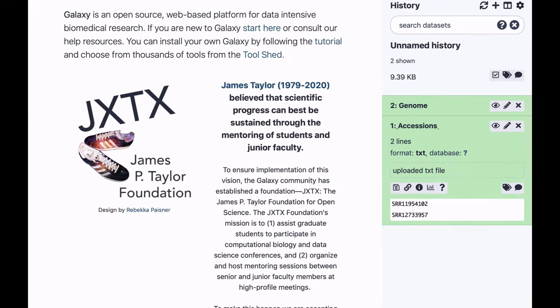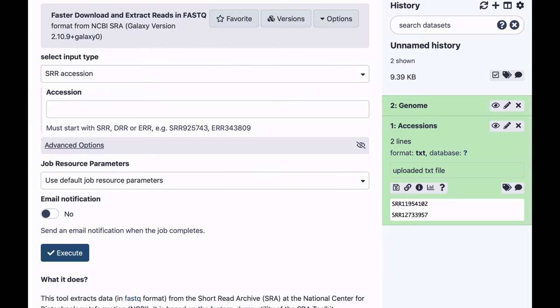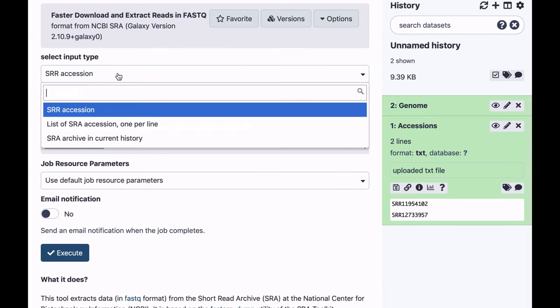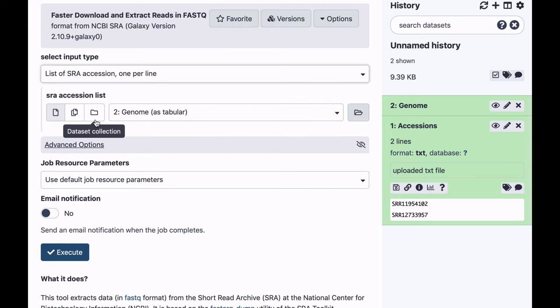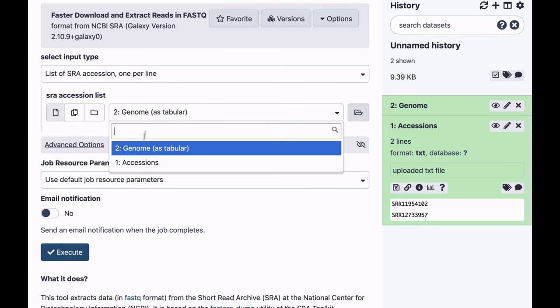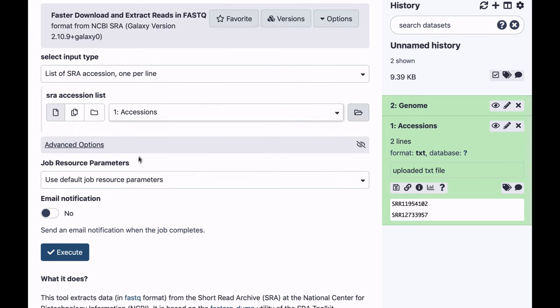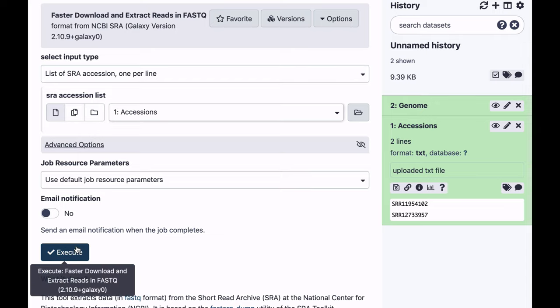To do that, we're going to go to Get Data, select fasterq-dump, select List of SRA Accessions 1 per line, make sure Accessions is selected here, and we'll click Execute.